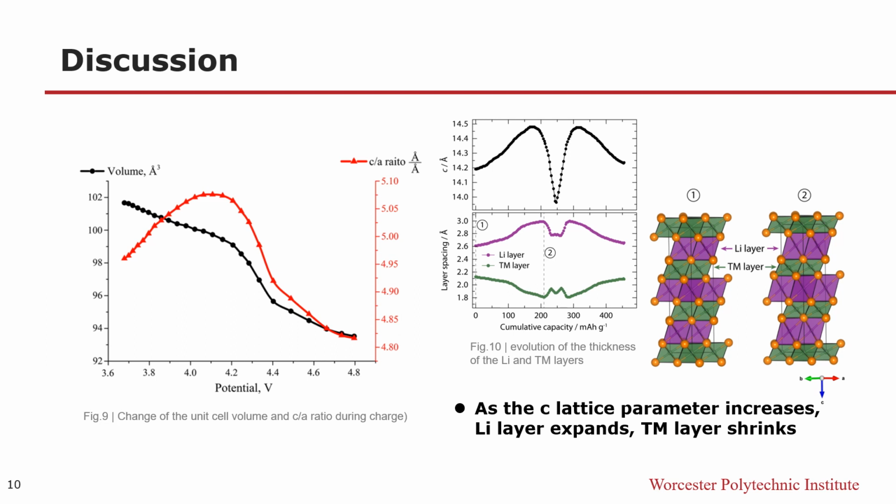These anisotropic lattice expansions are expected to lead to strain within particles, which can eventually cause particle cracking after prolonged cycling. However, the choice of a comparably low cutoff voltage also reduces the available capacity, removing one of the advantages of using NMC-811. As a result, future studies will focus on the role of cation and nickel defects in the lithium layers on lithium mobilities and C parameter changes.